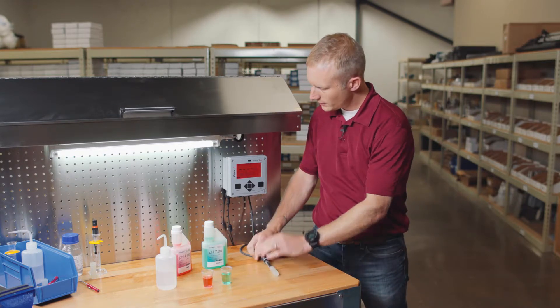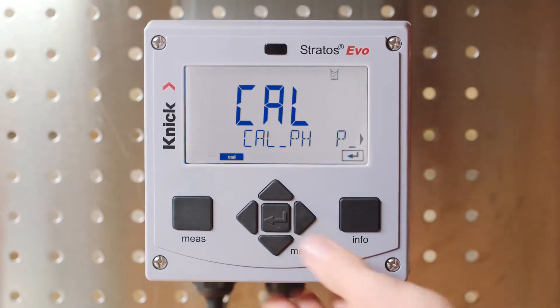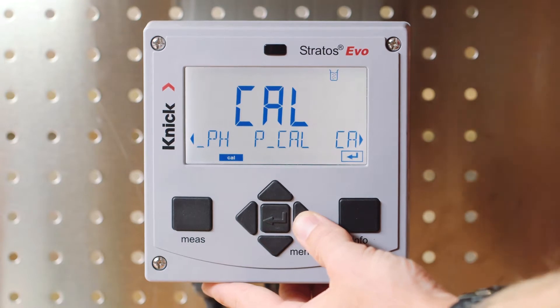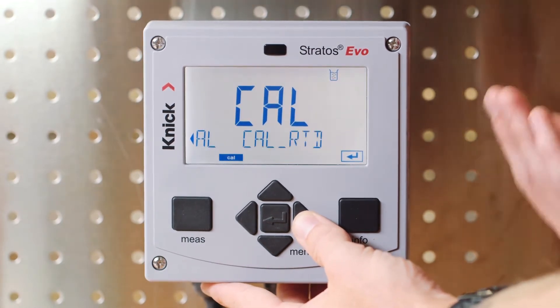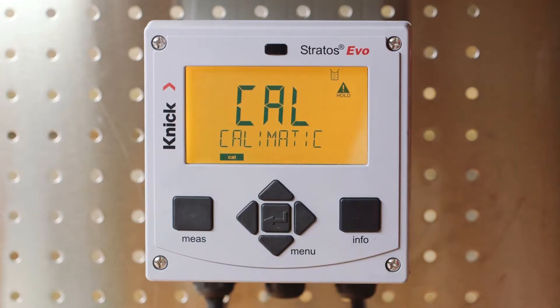Let's begin by connecting our MemoSense pH sensor, pressing the menu button, and then toggling right to the calibration screen. Here you will see our three options for calibrating the sensor: Cal pH, PCAL or process calibration, and finally Cal RTD or calibration of the internal temperature detector. We will select Cal pH to begin the process.